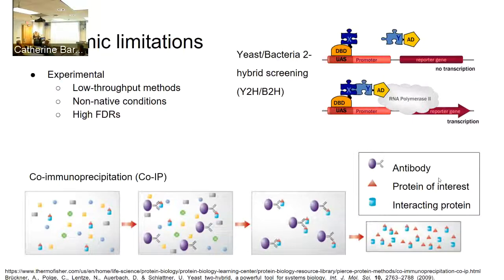So depending on what you're looking for, the fact that you're not in your protein's native conditions could mess up your analysis. Also, this technique has almost ridiculously high false discovery rates sometimes. When I started this project, Peter was like, oh yeah, we have this technique, we can use it, but it's got really high false discovery rates. Phil Andrews, who is a collaborator on this project, was like, oh yeah, it's got really high false discovery rates.